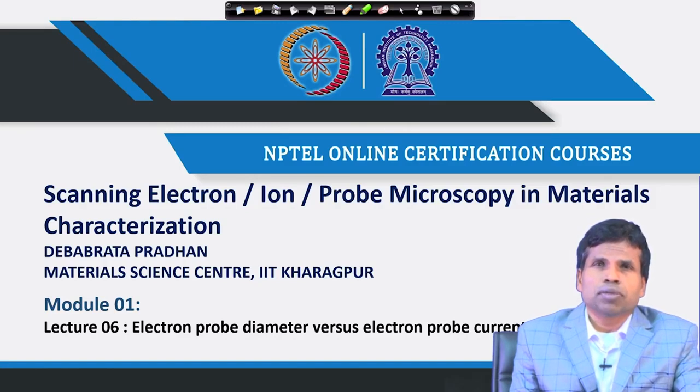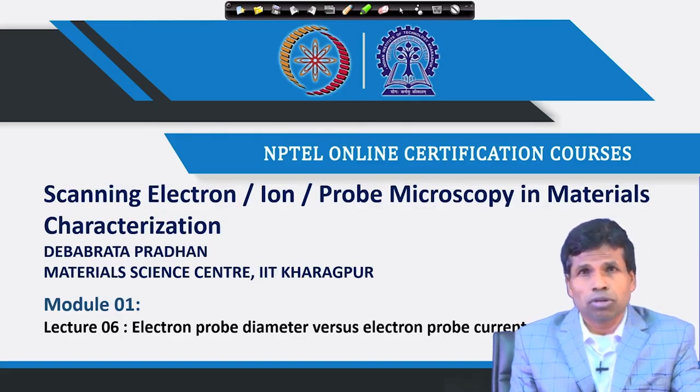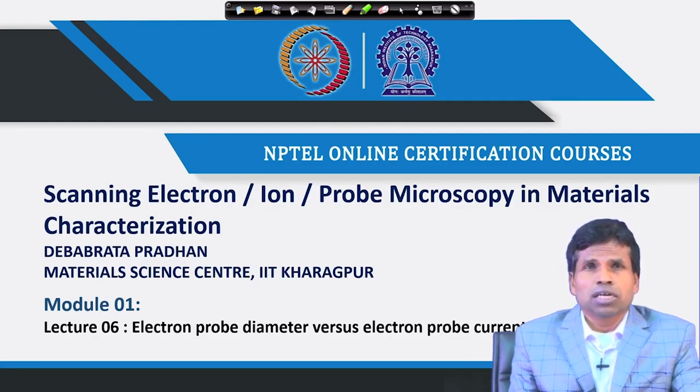Three different types of objective lens for different kinds of samples, and the condenser and objective lens are both used to condense the electron beam. First, the condenser lens will condense the beam of electrons to an extent, and then the objective lens will demagnify the electron beam to a finer size. The reason for using these lenses is to make the electron beam as fine as possible, so that it strikes the specimen over a small area.